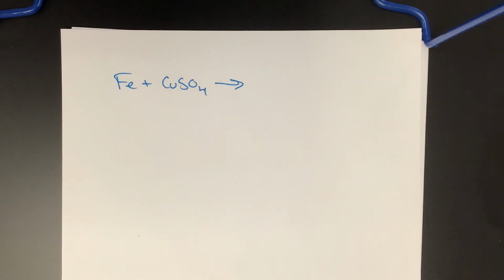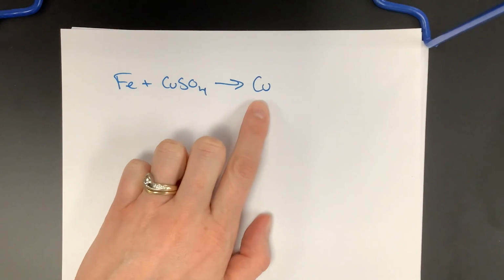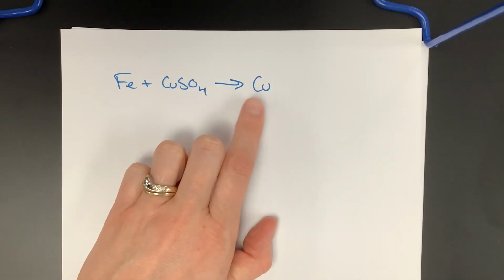And then I'll leave this one going, and then next hour we'll start a new one. But notice on there how there's stuff, it looks like it's growing on that iron nail. So that's one of the products being produced. Bryson? Are those copper crystals? Yeah, so let's make a guess. Let's predict what our products are. So you think one of them is copper? Yeah, that's one of our products. Copper metal. The stuff that's forming there.